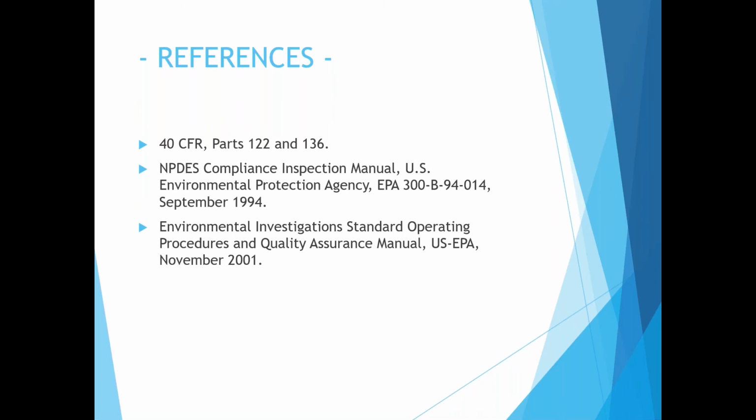And just so you know, on fecal, that has an 8-hour hold time. That's not 8 hours for you to get it to the lab. That's 8 hours for the lab to analyze it. So you really should wrap that one up as soon as possible, get it to the lab as soon as possible, so they have time to do what they need to do and still meet hold times.